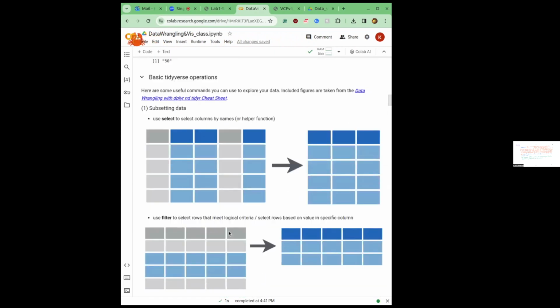All right. So, basic operations. This is a bit smaller, but I think it should be mostly visible. It truly is like 8 operations, and you can do everything. So the first thing that you would like to do with your data is select specific columns, or maybe drop some columns. For this, you would use select, and it would be select and the name of the column, or minus name of the column for dropping.